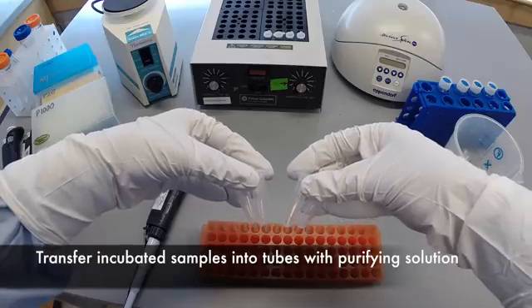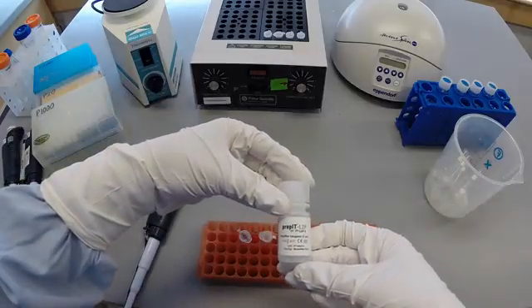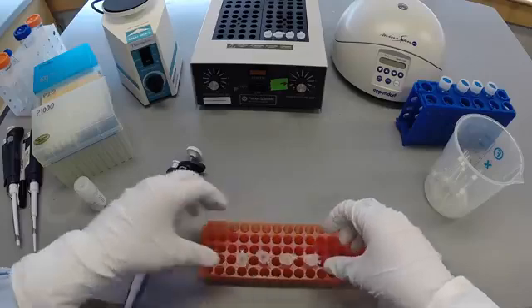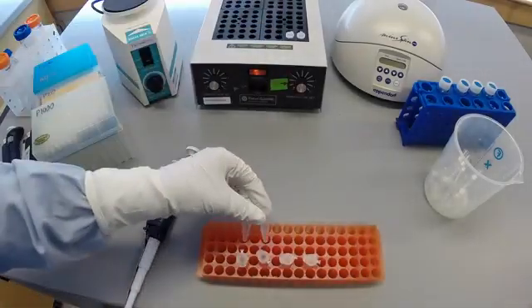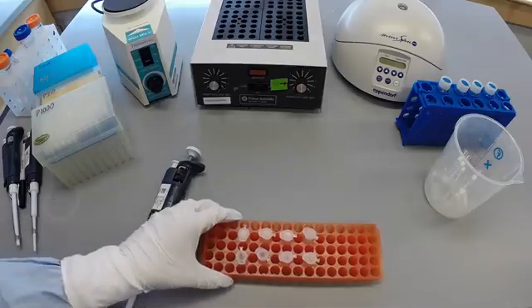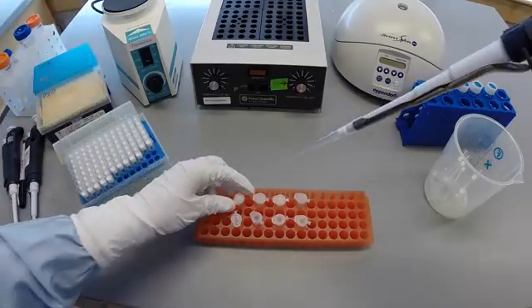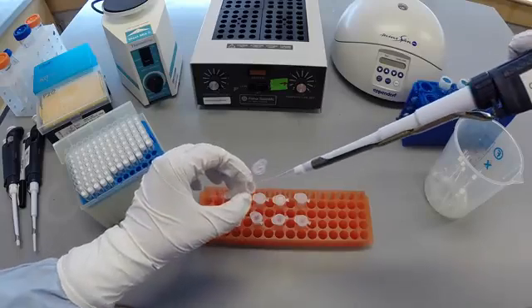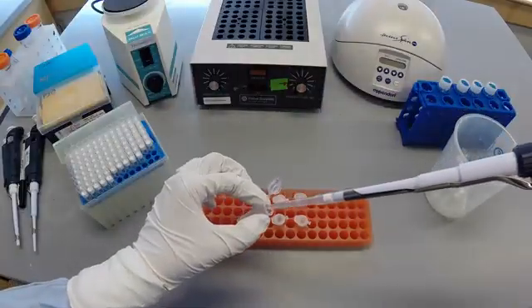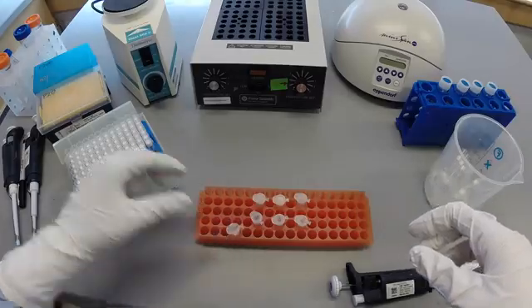Tubes containing 20 microliters of DNA Genotech's proprietary purifying solution, Prep-IT, will be provided. Once the samples have been incubated, you will transfer the entire volume to a tube containing the purifying solution. You may notice that the solution in the tube becomes cloudy. This is normal.